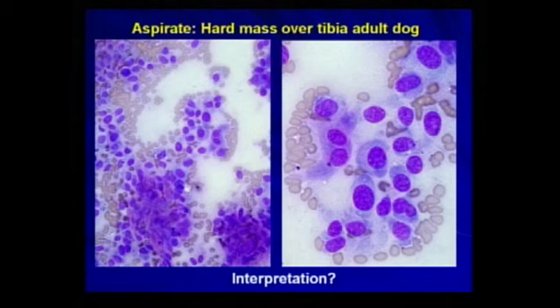Okay, they are somewhat pleomorphic, mild variation in nuclear size, prominent nucleoli, occasionally binucleated, and some of them are enmeshed in this pink material. A lot of them have somewhat eccentric nuclei and abundant mottled or dark blue cytoplasm.